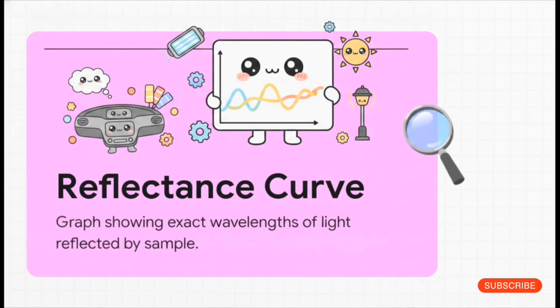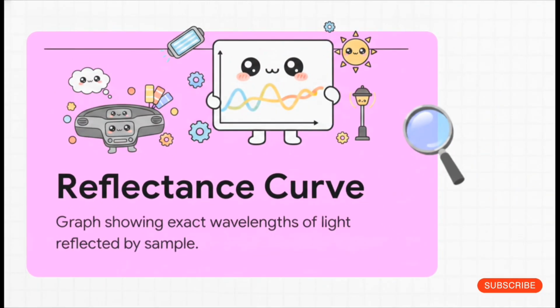And that is exactly where the reflectance curve comes into play. It's basically a graph that shows exactly which wavelengths of light are being reflected by your sample. Automotive companies don't just look at delta E, no way. They strictly analyze this reflectance curve. They need to ensure that the gray dashboard matches not just under the bright fluorescent lights of the lab, but out in the midday sun or under a street lamp at night.